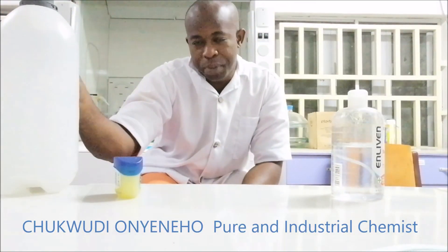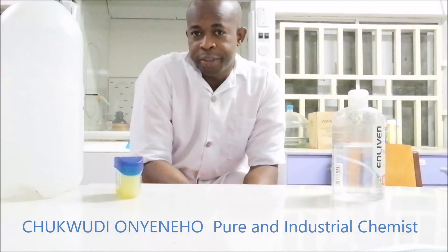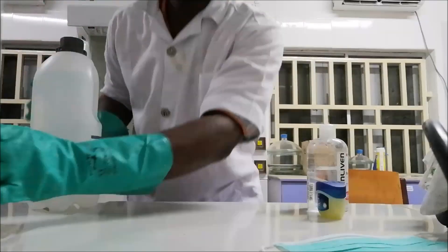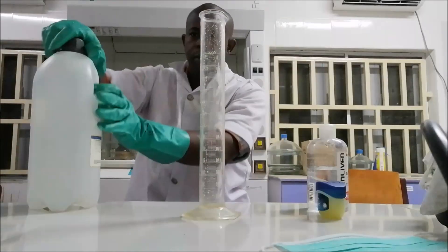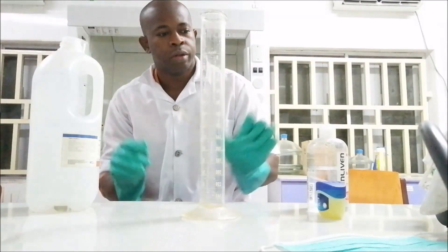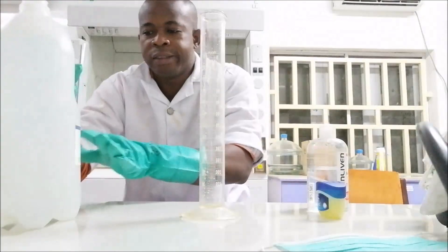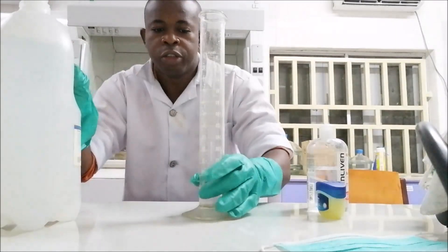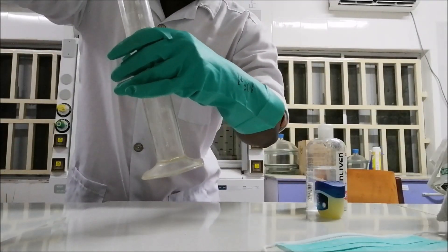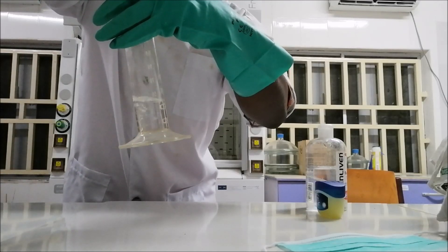All you need is more than 60% ethanol. Like what I have here — 95% ethanol, which is almost 100%. This is an emergency cylinder. You want to make a 70% concentration of ethanol in your hand sanitizer, so I'm going to add the 95% ethanol up to the 70% mark.